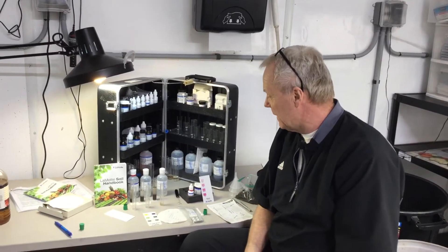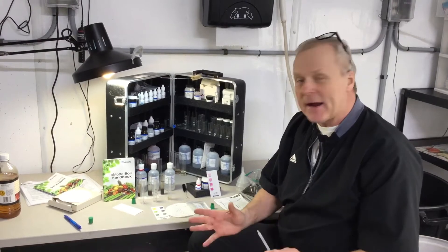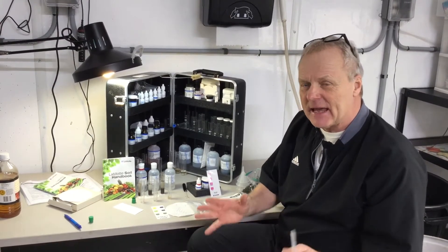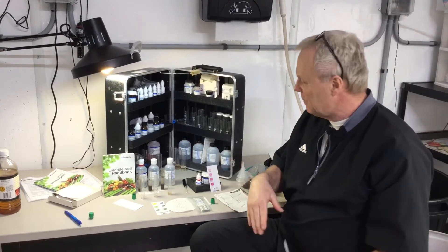Hey gang, so we're back out here in the greenhouse and we're setting up some soil samples. We're doing our macronutrients today of N, P, and K. We're going to break this into a couple of small sections — it's very simple to do.